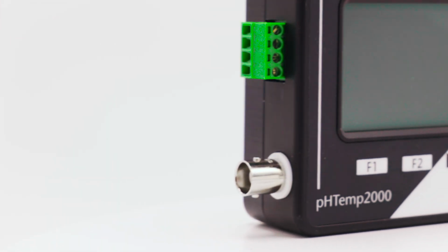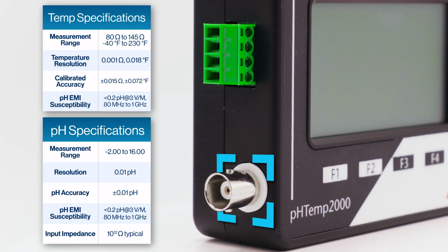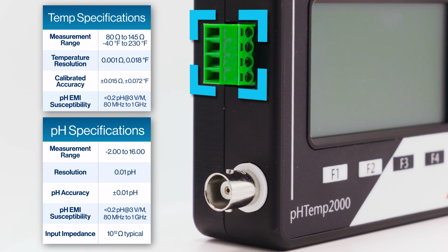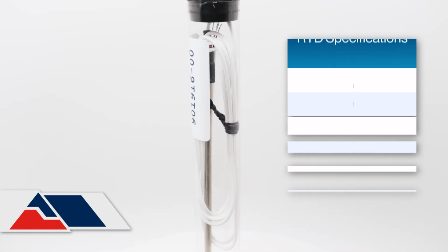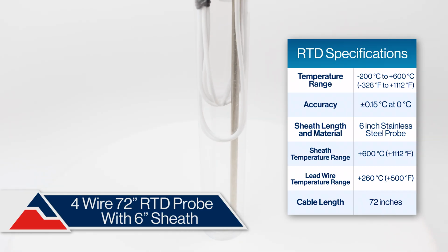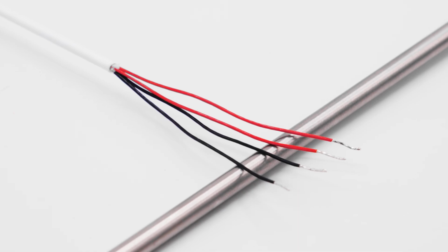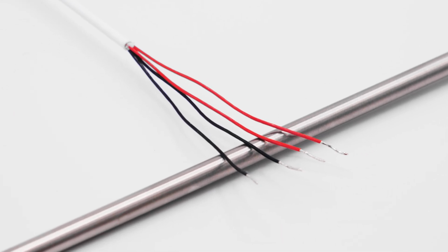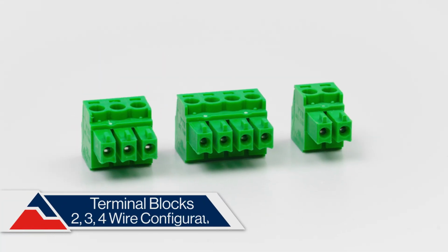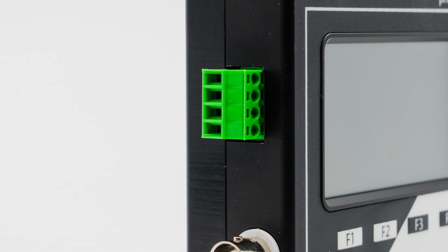On the left side of the data logger, you'll find the female BNC connector made for a pH electrode with an output impedance less than 300 megaohms at the desired temperature, and above that is the connector for an RTD probe. The RTD probe must be a 100 ohm platinum RTD with a 2, 3, or 4 wire configuration, but for the most accurate results, we would recommend using an RTD with a 4 wire configuration. Terminal blocks are also available in 2, 3, or 4 wire configurations depending on your needs.